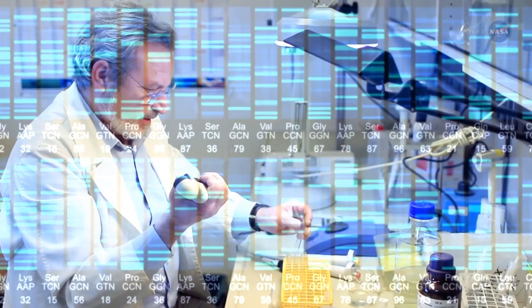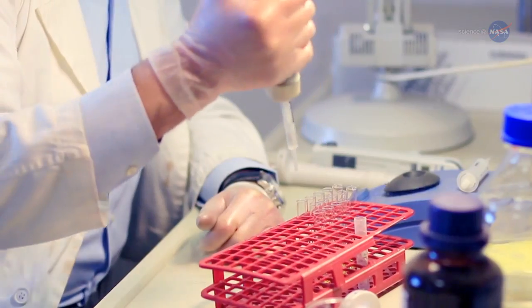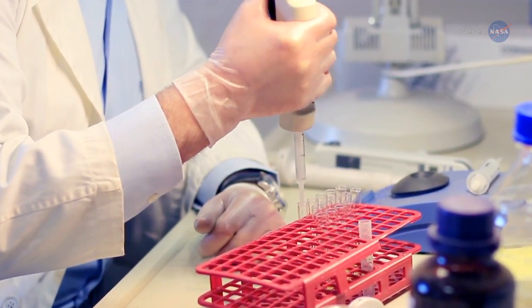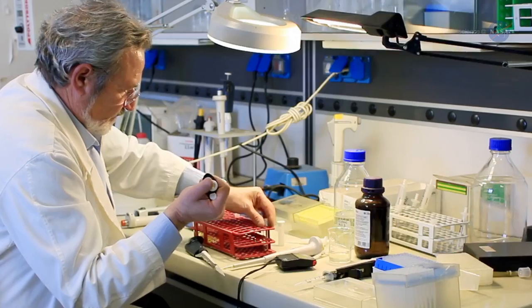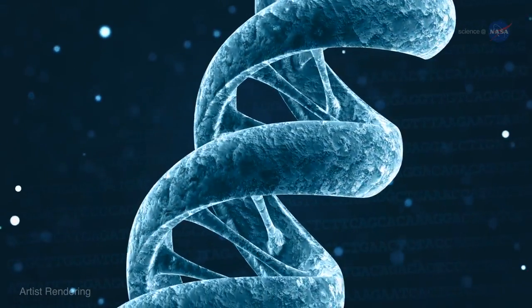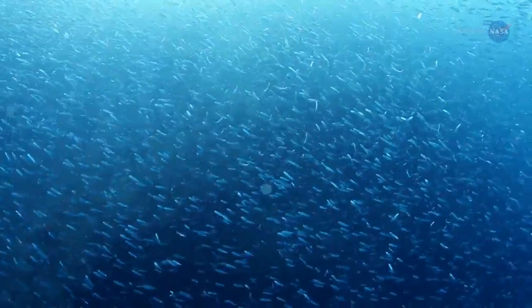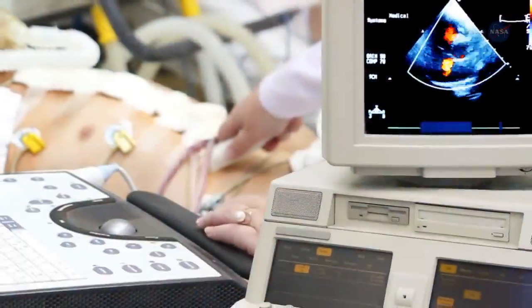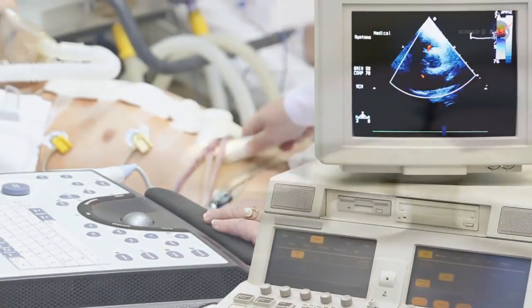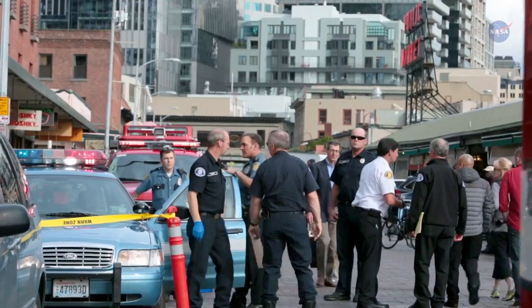Ever since the first strands of DNA were sequenced in the 1970s, researchers understood the profound significance of analyzing genetics for a wide range of medical and biological research. DNA sequencing is used to identify forms of life, to study how different organisms are related and how they evolved, to pinpoint genetic diseases in individuals, and to develop pharmaceutical treatments for maladies. It's even used for crime fighting.